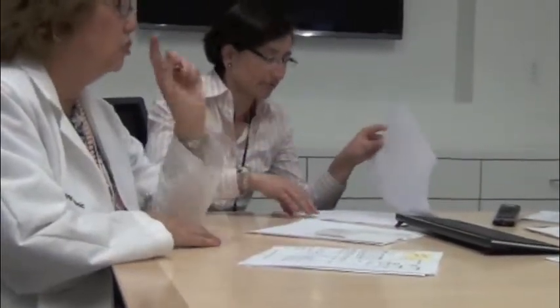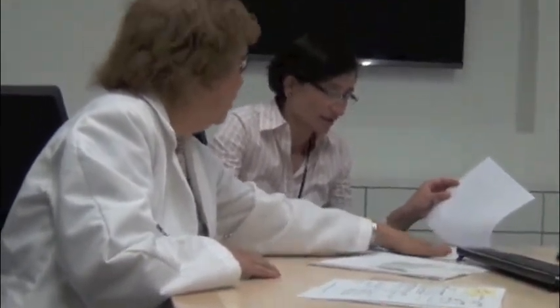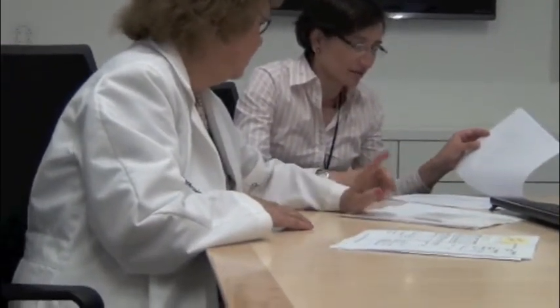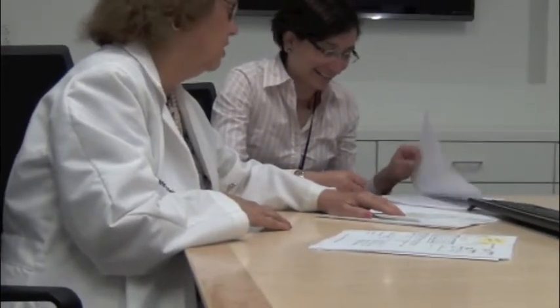Either what the machine told you, or if you think that your manual read is better, what your manual read is, and see where it says 60, those are the ones that will accept it. Usually you'll get 60s, it'll be one name, and it's like, yeah, that's probably what it is. But if you look through these sheets, there's a lot of 60s and different names for those 60 matches. So who here knows which of those organisms it is? Absolutely.